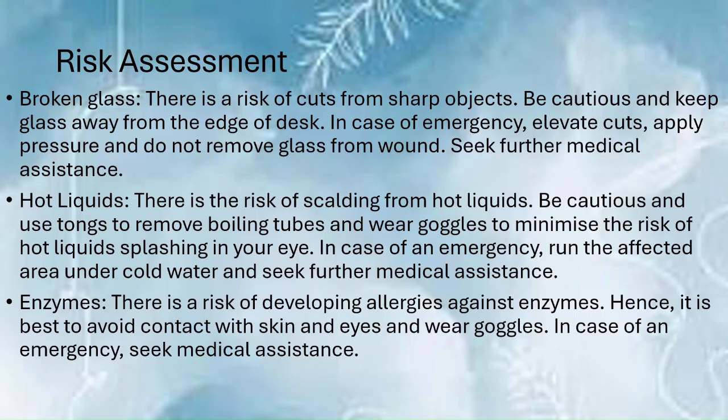So there's the other risk of hot liquids. There is the risk of scalding from hot liquids. Be cautious and use tongs to remove boiling tubes and wear goggles to minimize the risk of hot liquid splashing in your eye. In case of an emergency, run the affected area under cold water and seek further medical assistance.